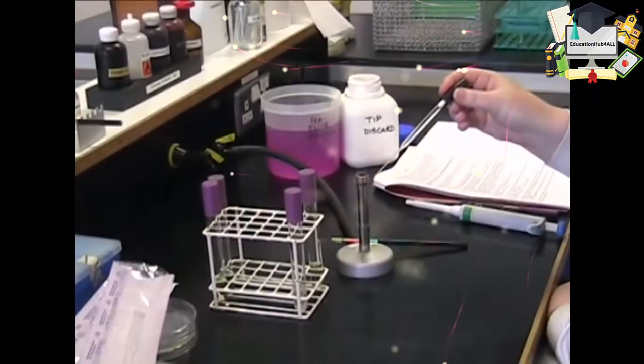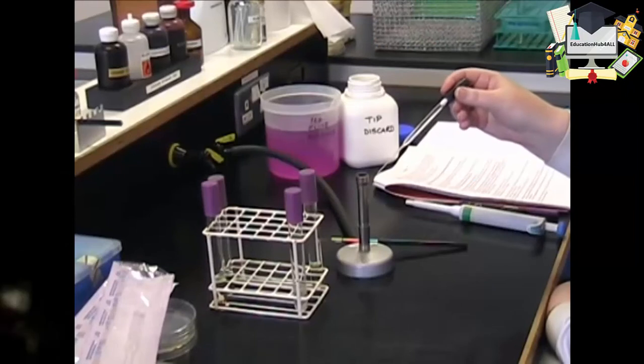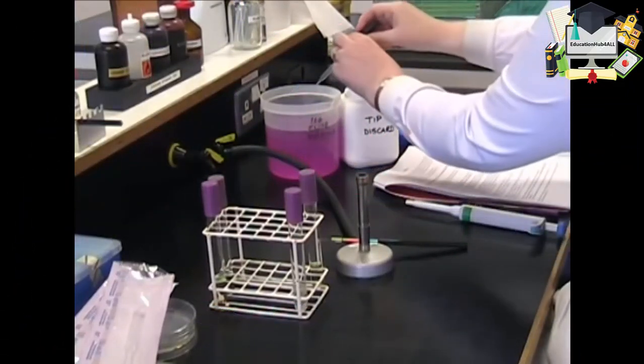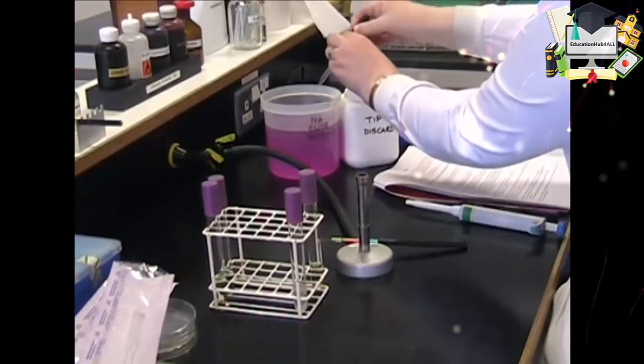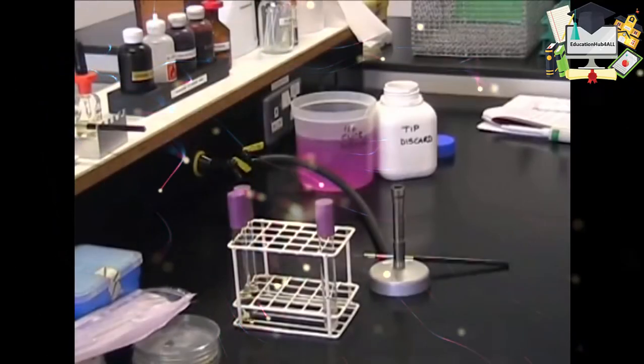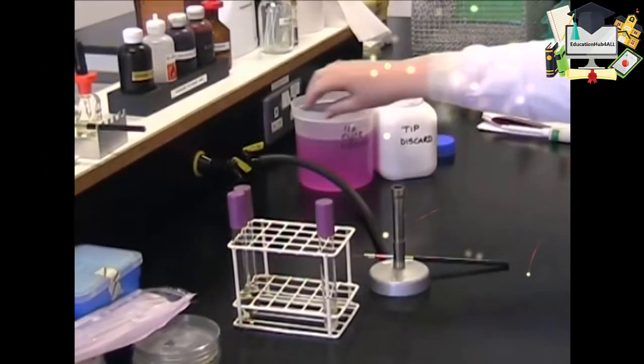If you're using a Pasteur pipette, it's also important to put this in the chloros solution, but remove the teat when you're over the pot to avoid any residues spluttering out of the end. Remember, when you've finished working with your Bunsen burner, to turn it off at the gas.